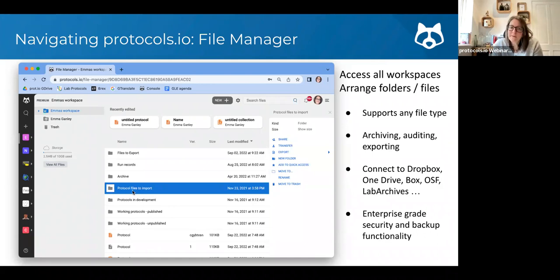You can see with something selected on the right-hand side, there's an export option, and if I click that through, there are places I could push content to Dropbox or OneDrive, various other things, links with some electronic lab notebooks, etc.